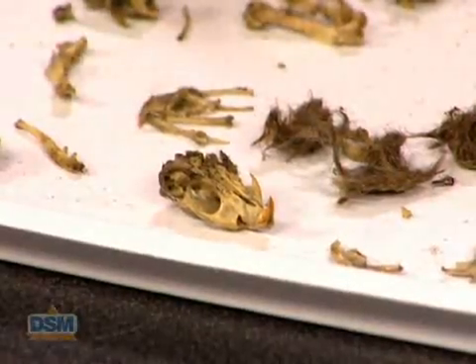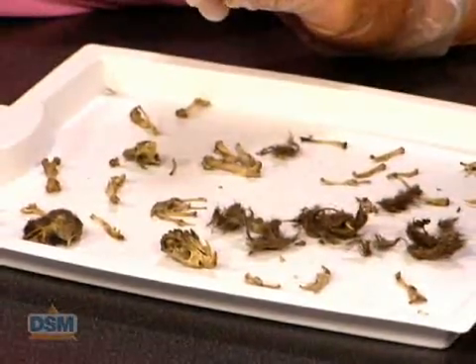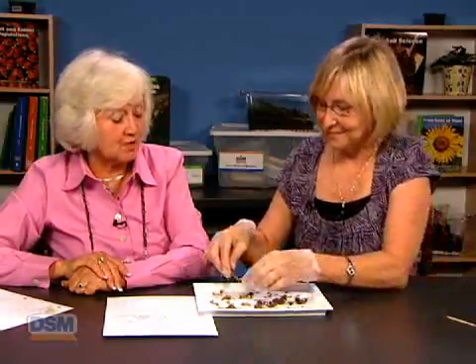Now, it is possible that they would find a bird skull, in which case they would be looking for the beak and probably evidence of feathers. They might also find some shrew skulls, which would be even smaller than the mouse, which would be a meadow vole or other kind of rodent.